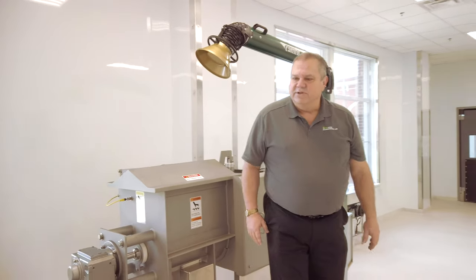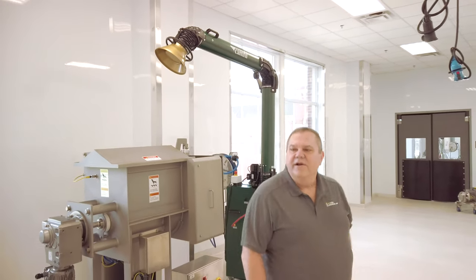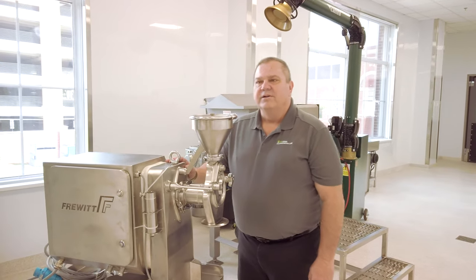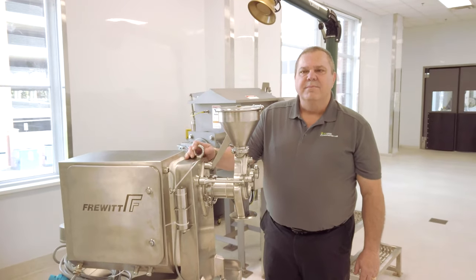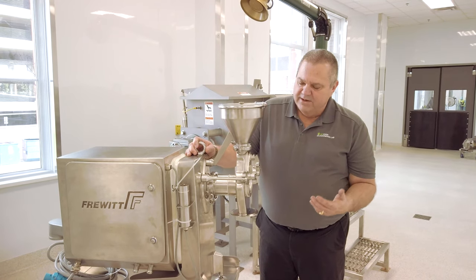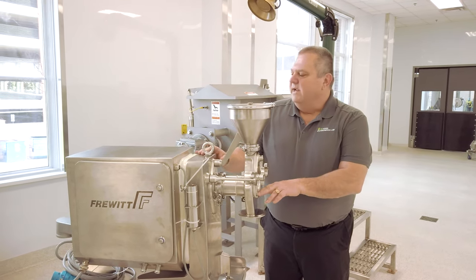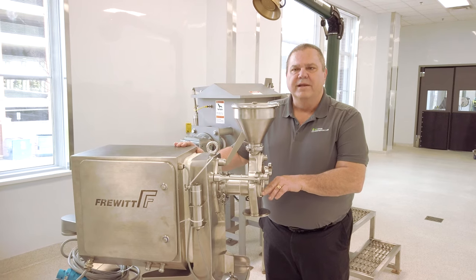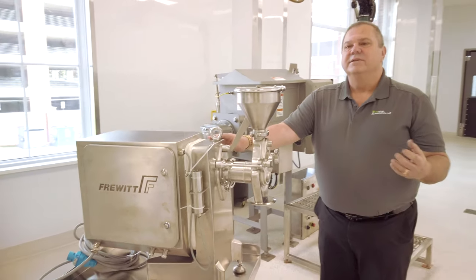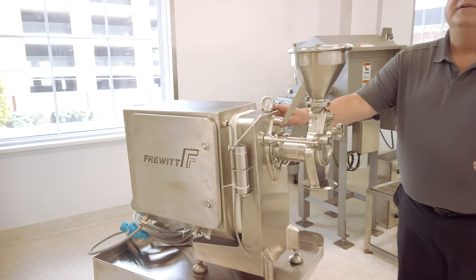A number of our customers are also interested in having a very particular particle size. In order to get to those particular particle sizes, we may need to mill the powders we remove from our freeze dryer or our spray dryer. Here we have a hammer mill attached to a Frewitt milling piece of equipment. This enables us to go from 10 millimeter size particles all the way down to 50 microns.